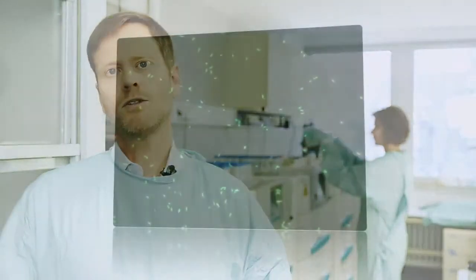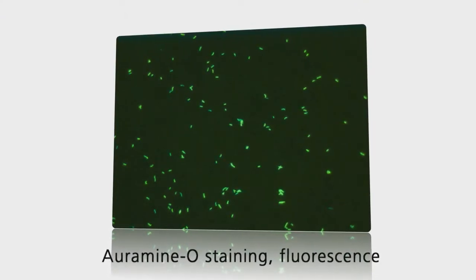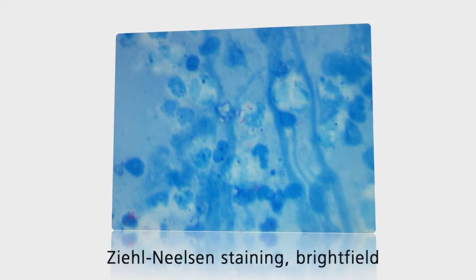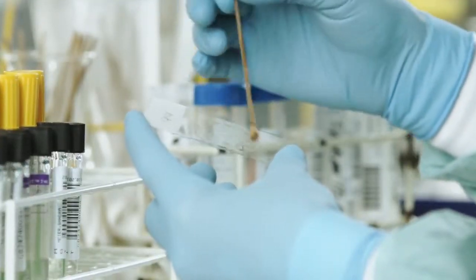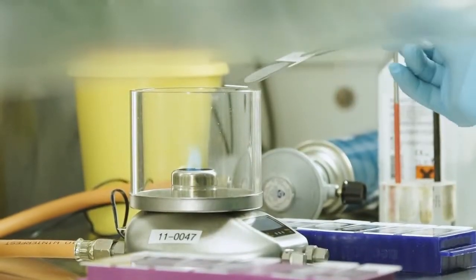You can easily detect the tuberculosis bacteria at a glance by staining preparations with auramine. This process is much easier than using conventional Ziehl-Neelsen staining. First, mark your microscope slide as usual and streak the material as evenly as possible on the surface. Then, fix the air-dried smear with heat.